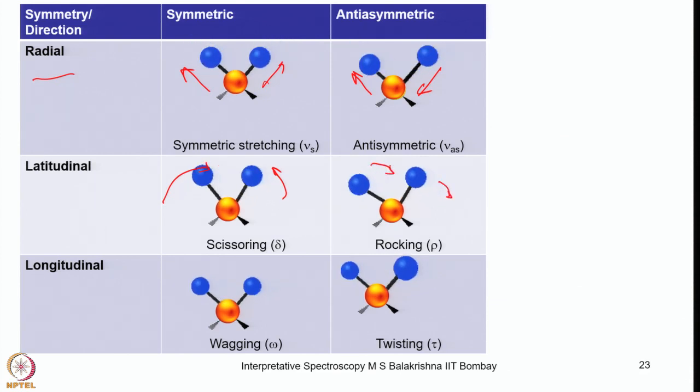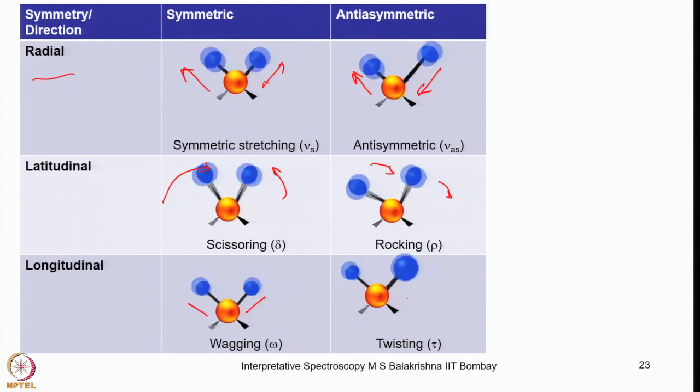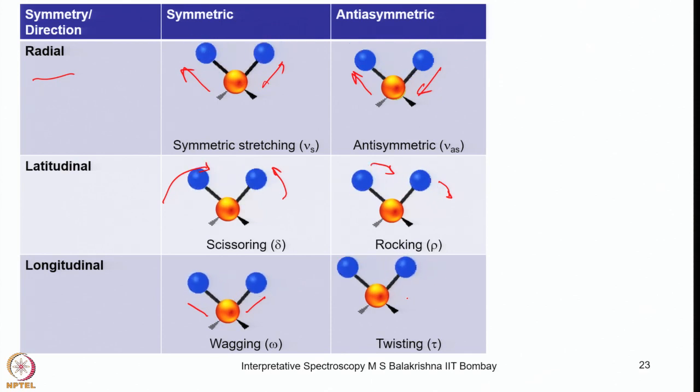So this is rocking, and this is wagging. And then this is twisting here. Twisting would be something like this. Wagging is something like this. And twisting is something like this, a screw action. So these are the fundamental stretches.